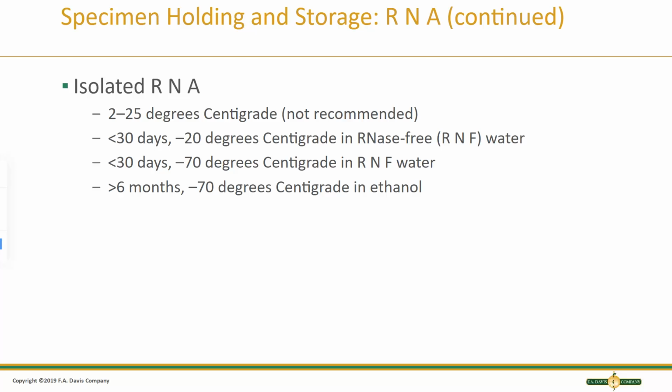Isolated RNA is not recommended to be kept at room temperature. Less than 30 days, store at -20 in RNase-free water, or less than 30 days at -70 in RNase-free water. And greater than 6 months, store at -70 degrees in ethanol.